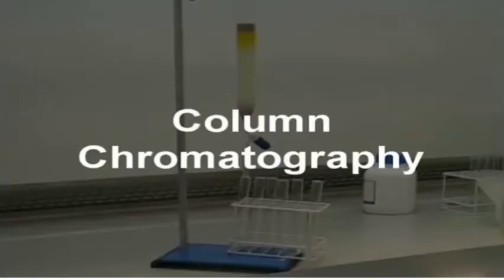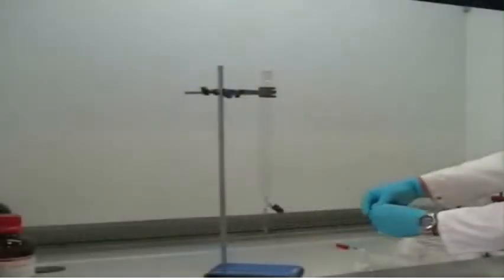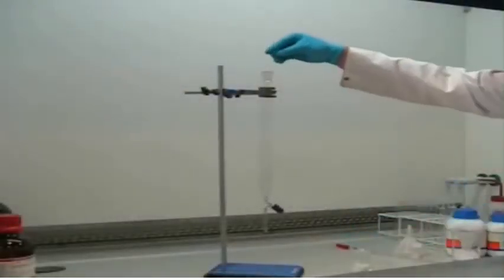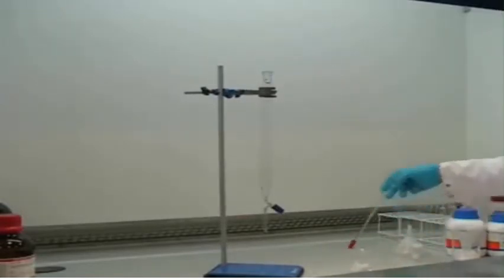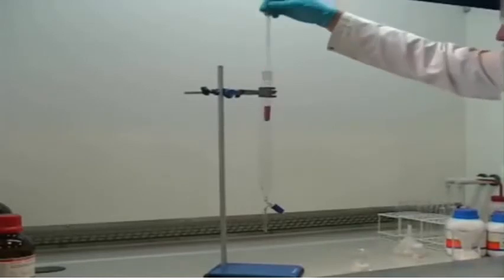This video outlines a method for carrying out column chromatography. You may be given slightly different instructions when you do this in the lab, but the principles will be the same. First of all, a small piece of cotton wool is placed in the bottom of the column to prevent solid material from going into the tap. Different columns may have different types of tap, but obviously the idea will be the same.